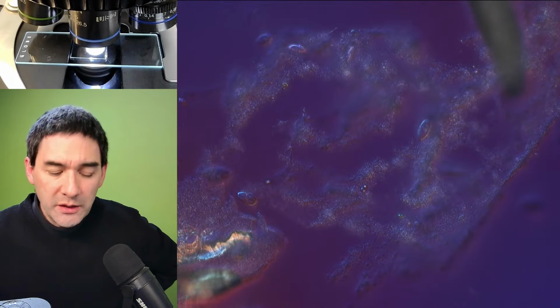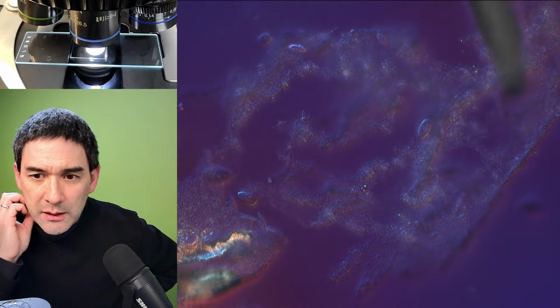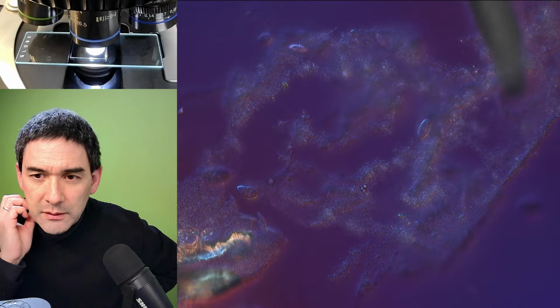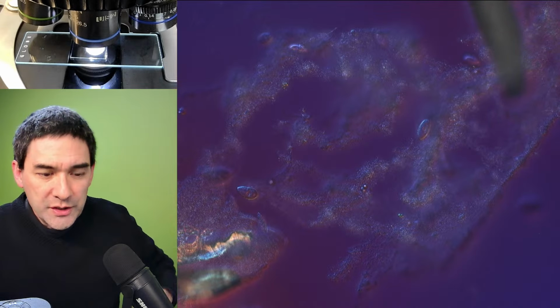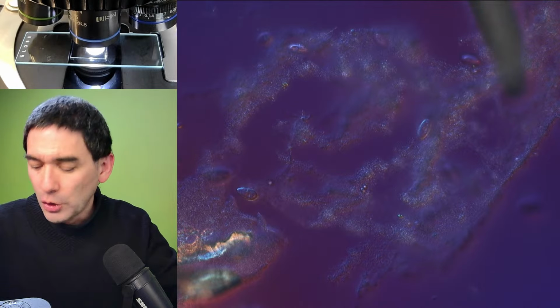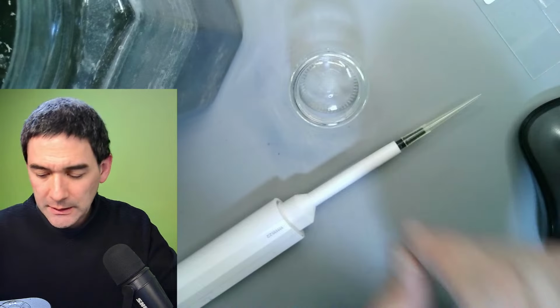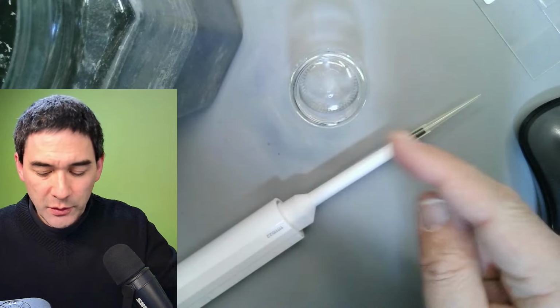So what I therefore sometimes do is the following. I'm just going to show this to you, okay? I'm just reading some of the questions. I will go back to those questions later. But you need a jar, a small one, okay?